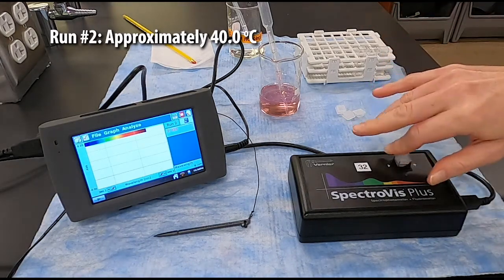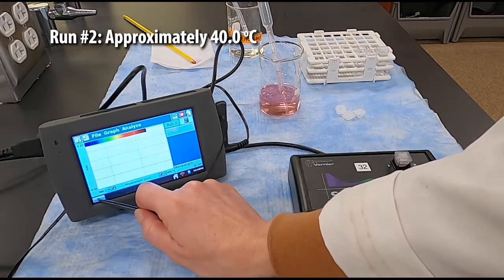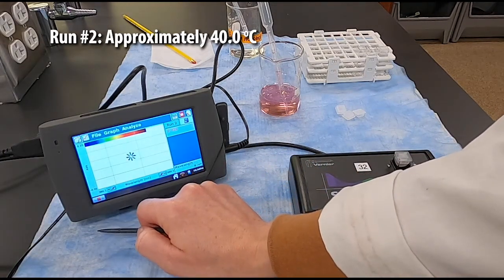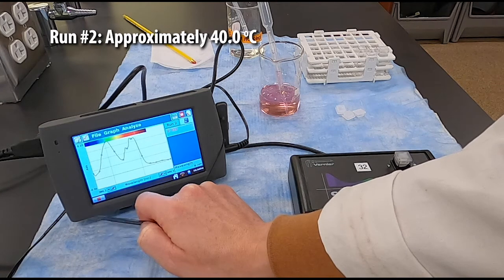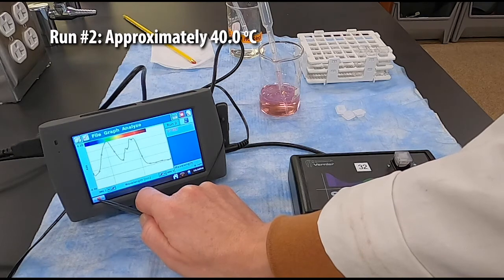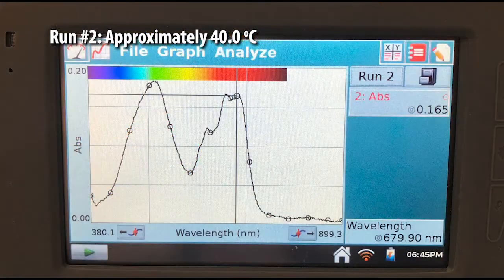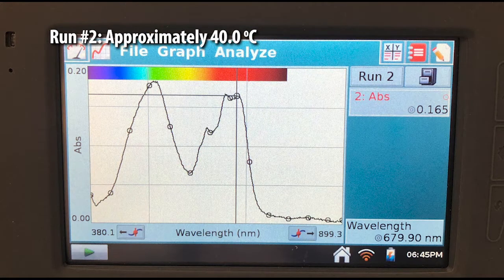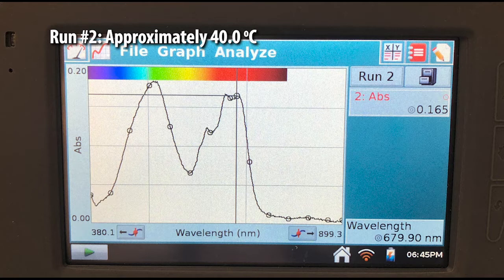When doing this in real life, you want to try to collect the spectrum quickly after you take the solution out of the water bath to make sure it doesn't have time to cool down first. Once again, you're going to write down what the absorbance is of this second peak at its lambda max.